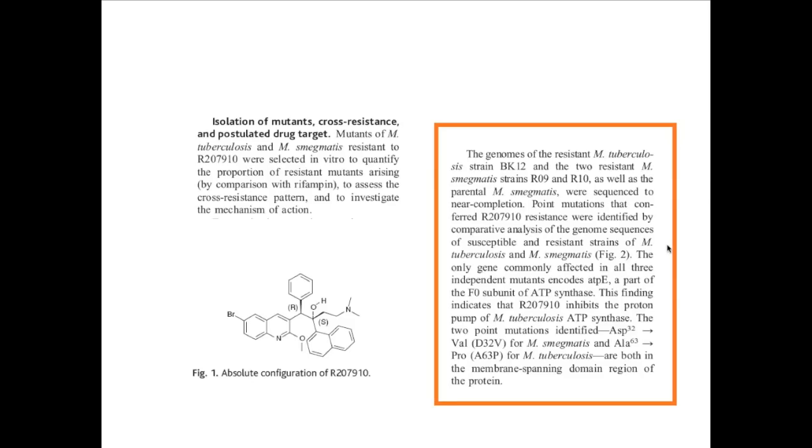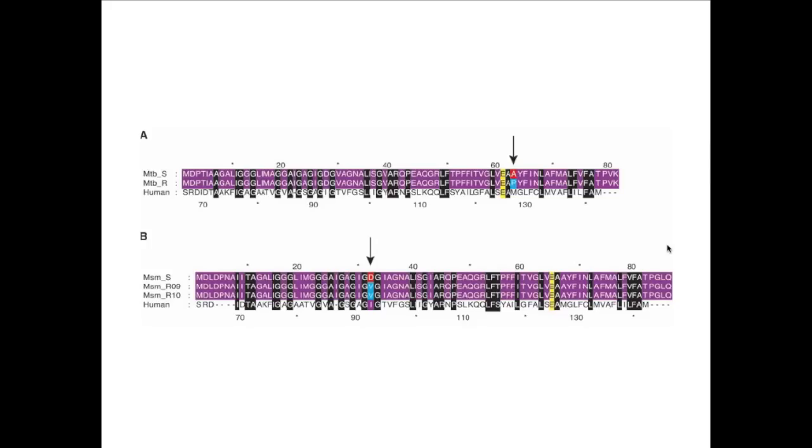That's something you couldn't imagine doing, that experiment, without this vastly scaled up DNA sequencing capacity, and that certainly leads in the direction of being able to use this sort of method for a lot more similar kinds of brute force experiments where you isolate an interesting biology in cells and you want to correlate it with gene variants.